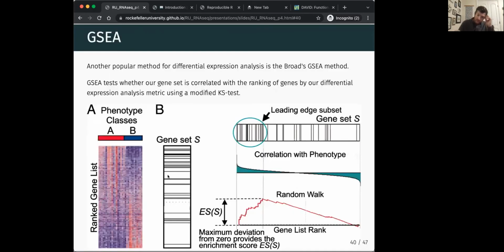Oh yeah, was TopGo? Yeah, we like TopGo. We like TopGo a lot. We just find TopGo is really nice because the way it does the Go analysis, specifically for Go term analysis, it builds all of the trees itself, and so it has a lot more information contained within it. You can also do more complicated algorithms for deciding the enrichment analysis. So when we do the enrichment analysis, it does the very basic enrichment score.